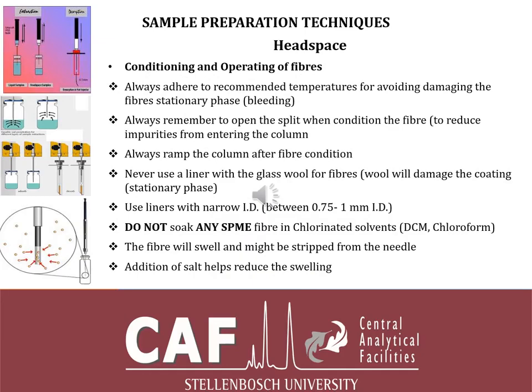As mentioned earlier when I was talking about the SPE, it is also important with the SPME to condition the fiber before using it. If one does not condition it, when you run on the GC you might see peaks, especially if you've got an FID, and think it's a peak from the compounds, especially if you're working with unknowns, only to find that it's coming from the bleeding of the stationary phase of the fiber.